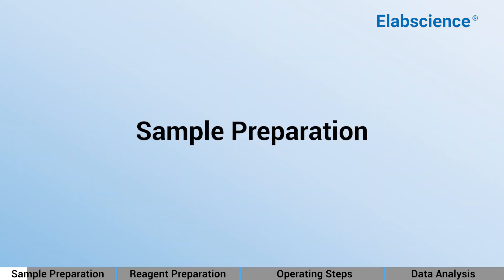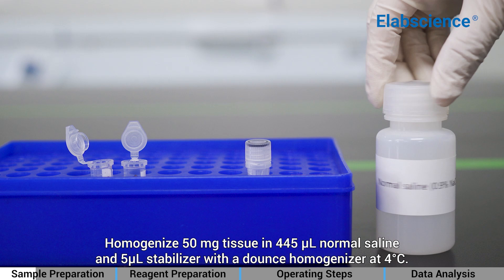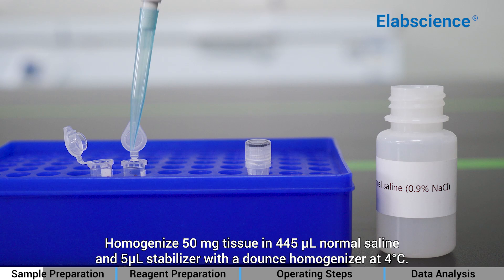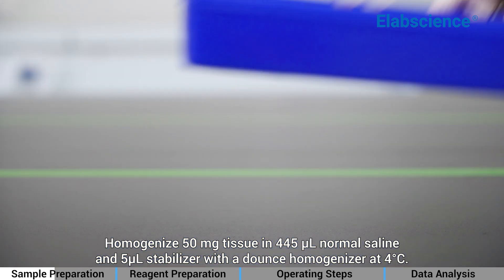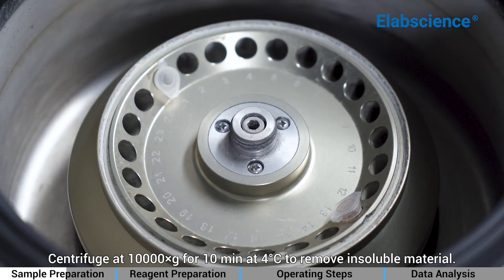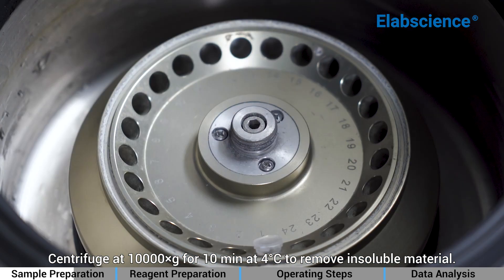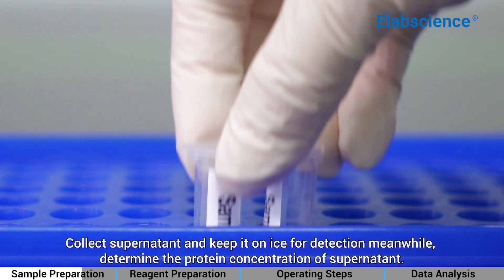Sample Preparation: Homogenize 50 mg of tissue in 445 µL normal saline and 5 µL stabilizer with a dounce homogenizer at 4°C. Centrifuge at 10,000 × g at 4°C for 10 minutes to remove insoluble material. Collect the supernatant and keep it on ice for detection. Determine the protein concentration of the supernatant.